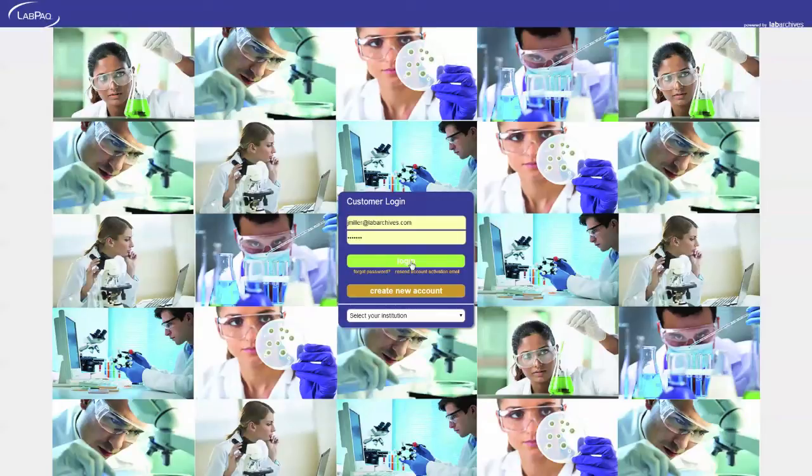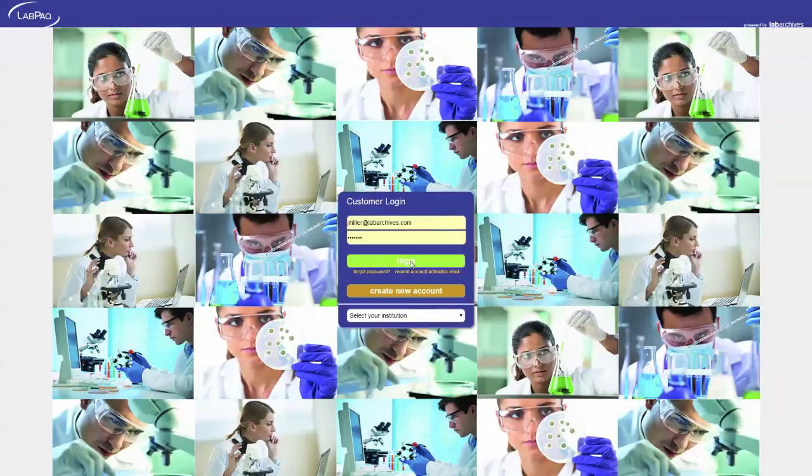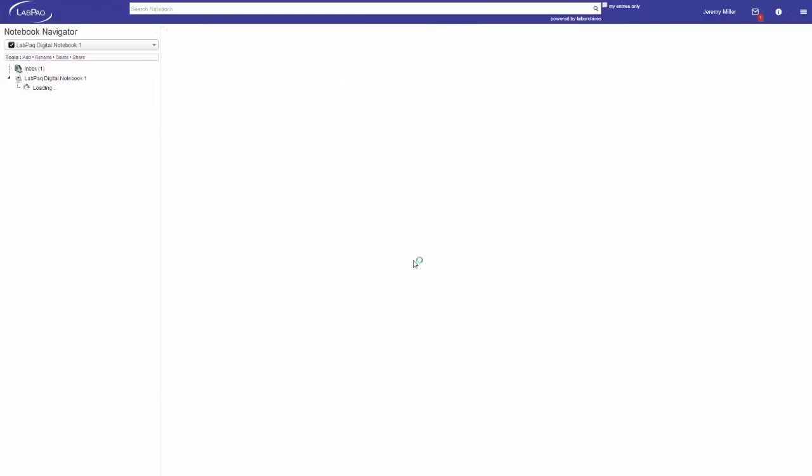Welcome to LabPack Digital Notebook powered by LabArchives. This instructional video will cover the basic setup process of the course notebook and adding students to a class within the web-based notebook application.